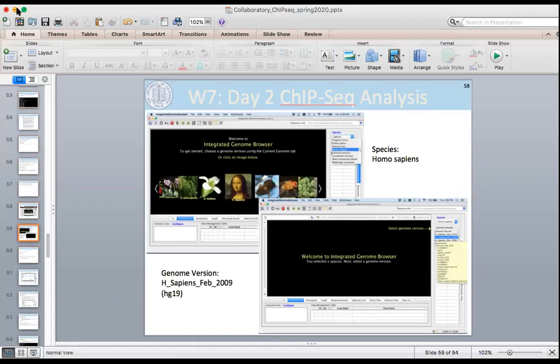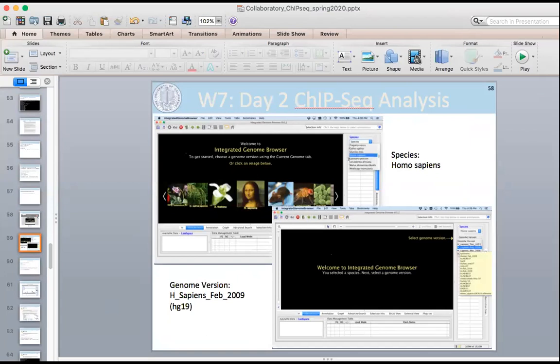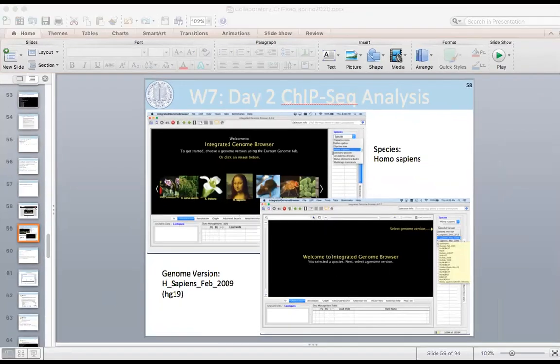So what I'm going to do is open IGB, which isn't the fastest program, but shouldn't take too long.